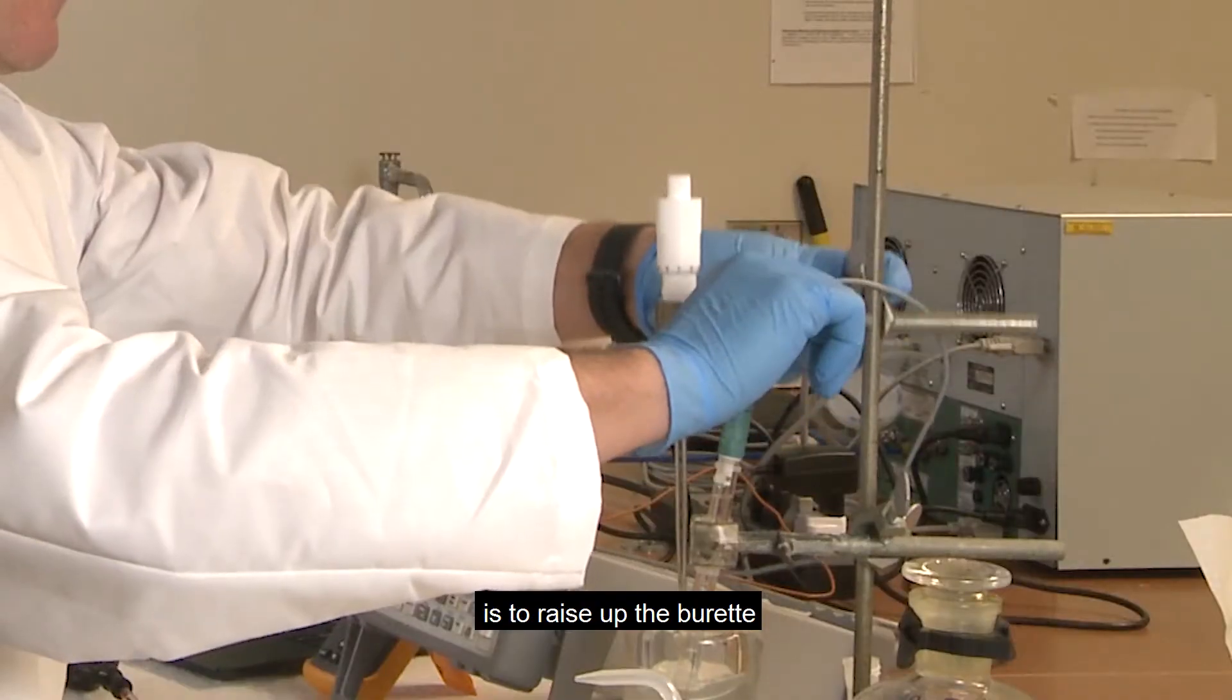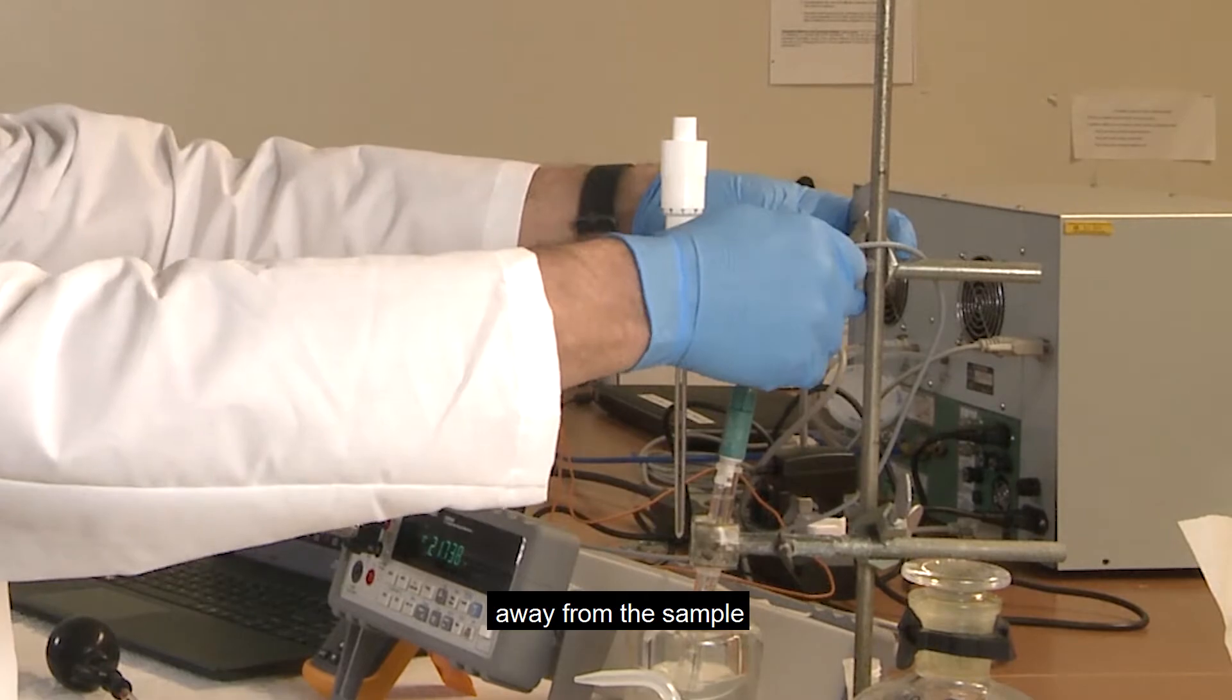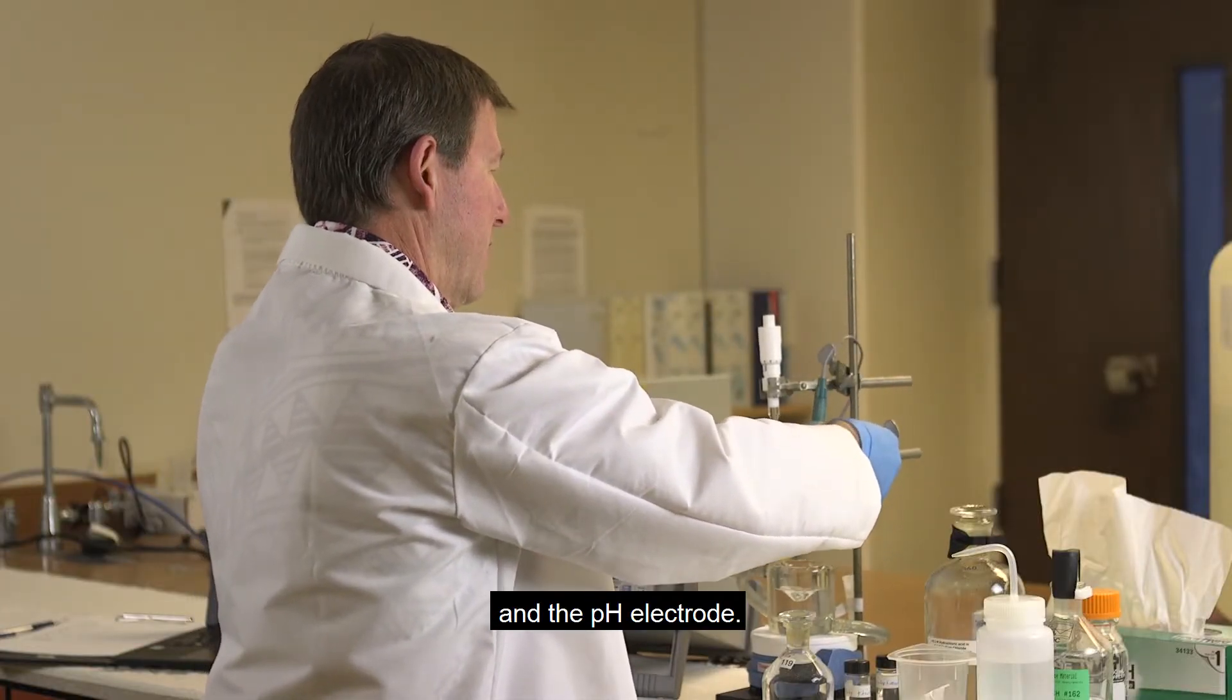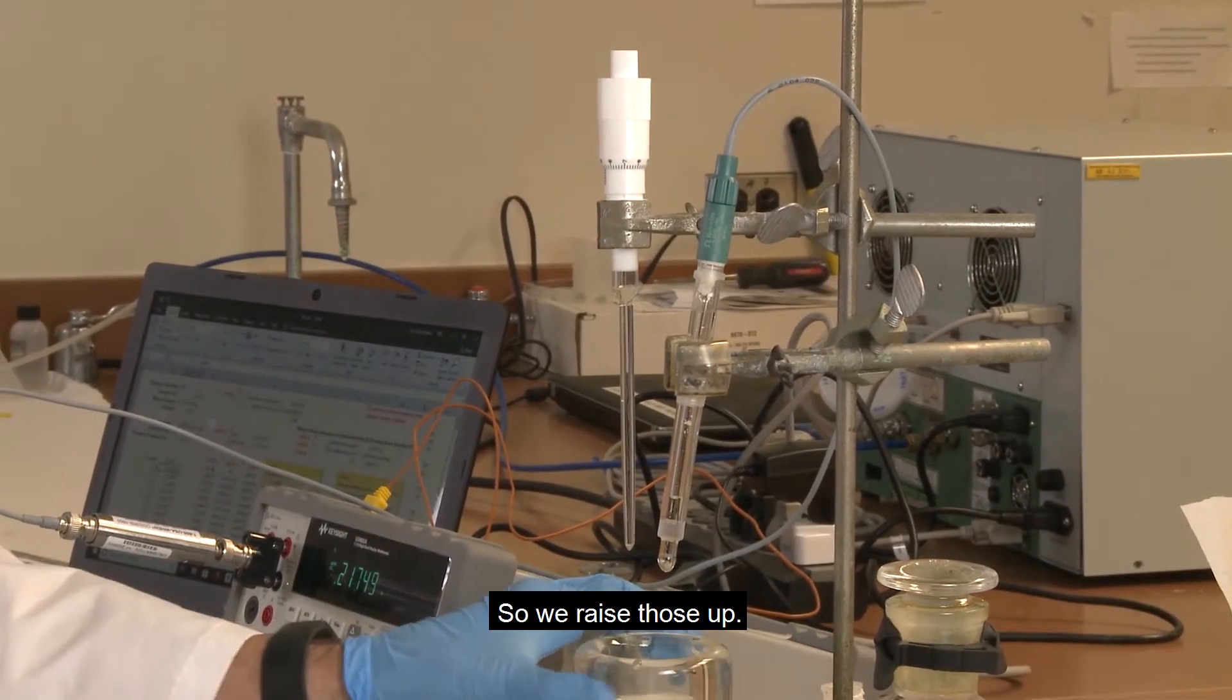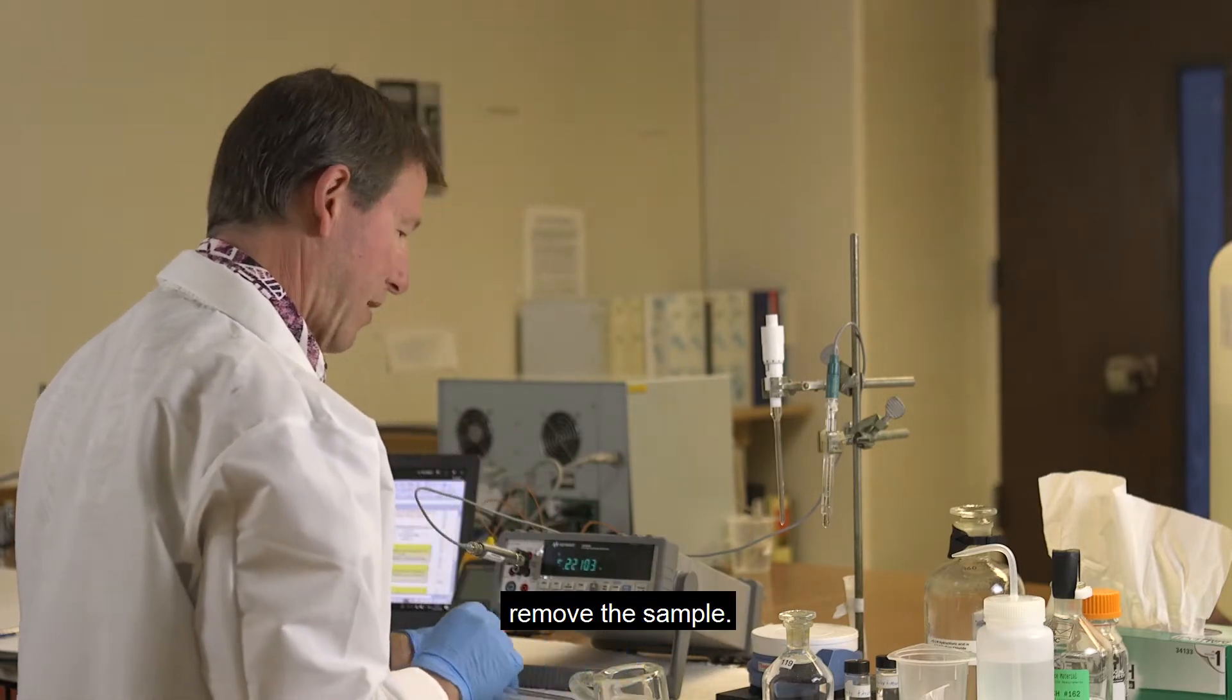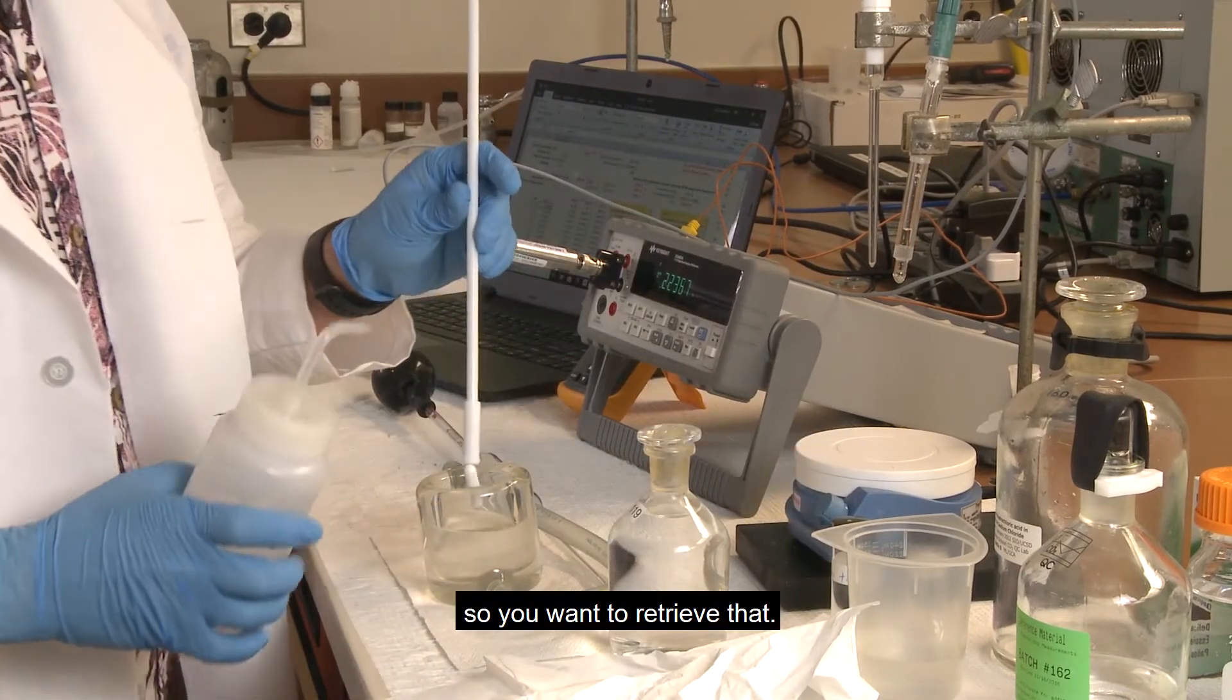The first thing we want to do is to raise up the burette away from the sample and the pH electrode. So we raise those up. Then we will remove the sample. You've got the stir bar in there, so you want to retrieve that.